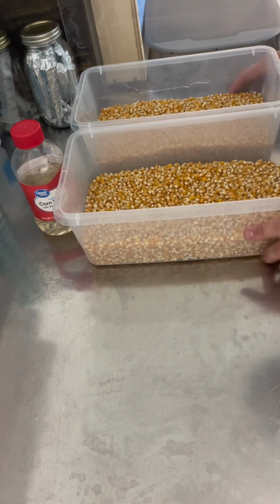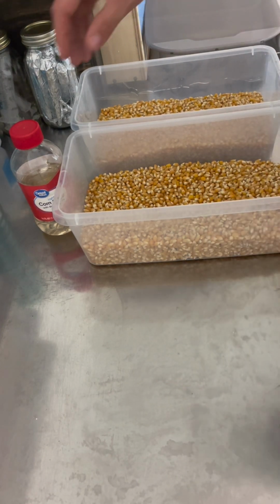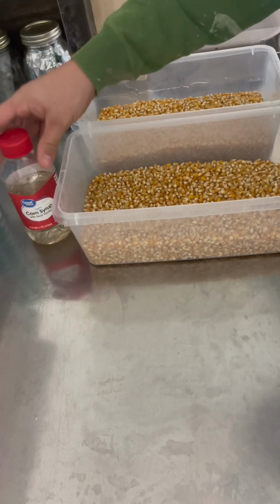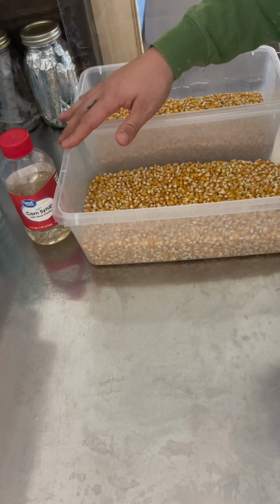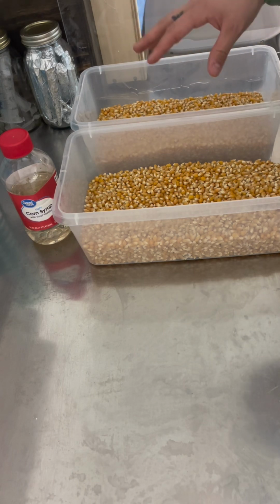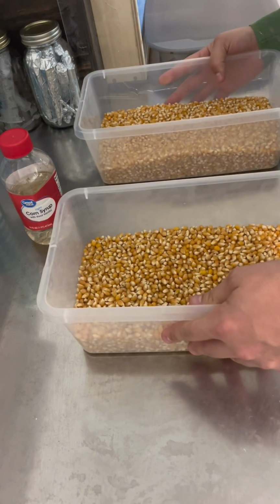When I pressure cook them to absorb the water, I'm going to do it in the exact same amount of water. And when I do it with the corn syrup, I'm going to measure out 1.5 ounces into the water. I'm going to put it in, and then I'll pressure cook them both for 30 minutes to absorb the water. Take them out, let them air dry for a little while, and then I'll put them in jars. This makes 7 jars. This makes 7 jars.